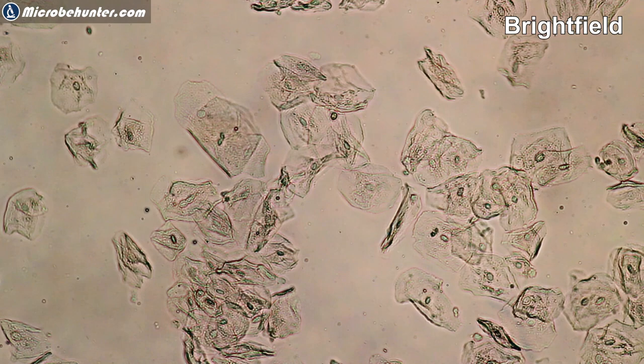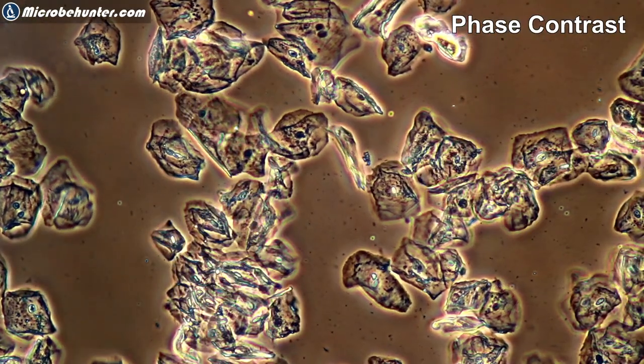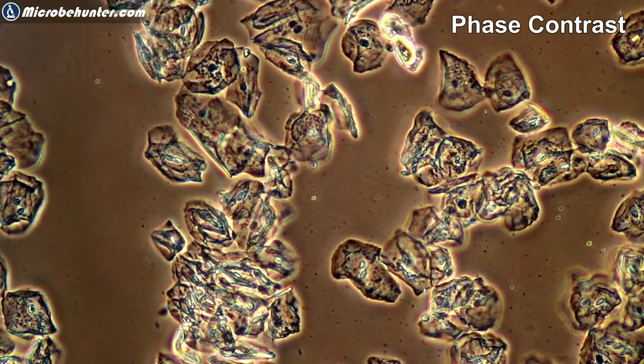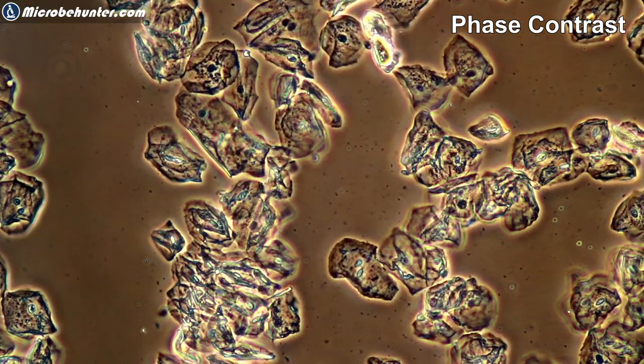Here, that's phase contrast. Look at this. And if you look carefully into the cells, then you can also see the nuclei and the nucleus in each cell, which is also visible quite well.